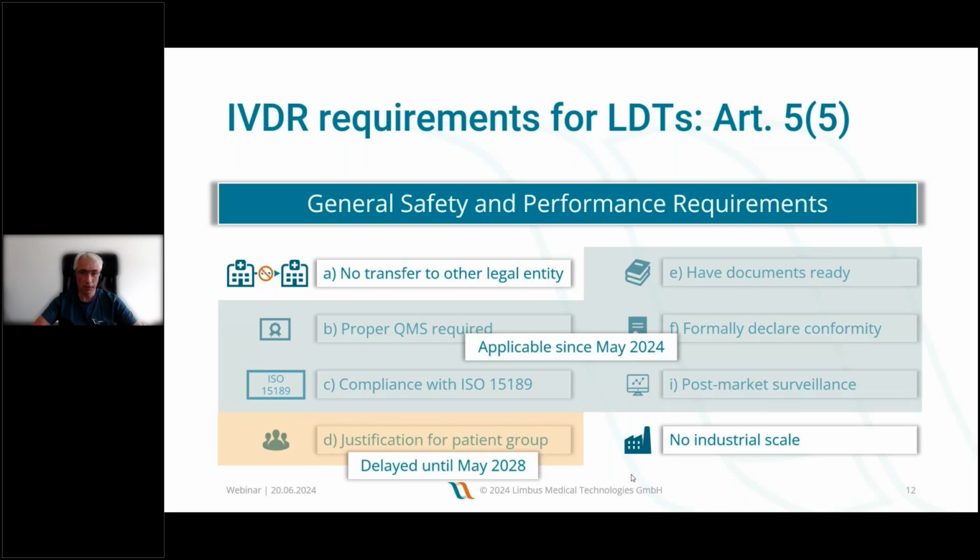Okay, so interesting. There is a large fraction of you who have not seen such declarations of conformity. Again, it's okay. It's fresh, I have to admit. Since three or four weeks, these declarations of conformity should be available now, and laboratories are required to draw them up. Let's see how many are going to do that and how this is going to develop in the future.